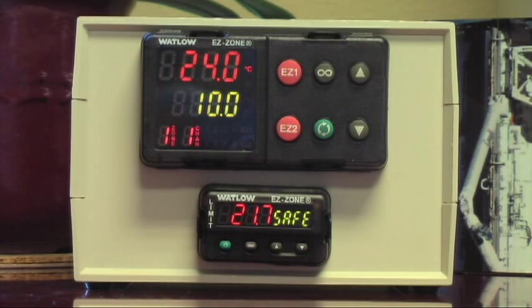Catherine: Yeah, Mary. I just got my new TVO vacuum oven from Cascade Tech. Congratulations, you must be so excited! I am a little bit anxious because I have no idea how to work this controller.